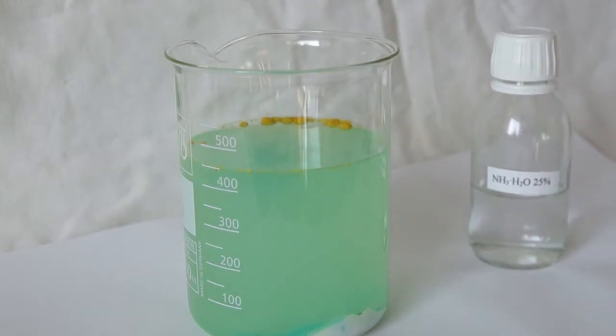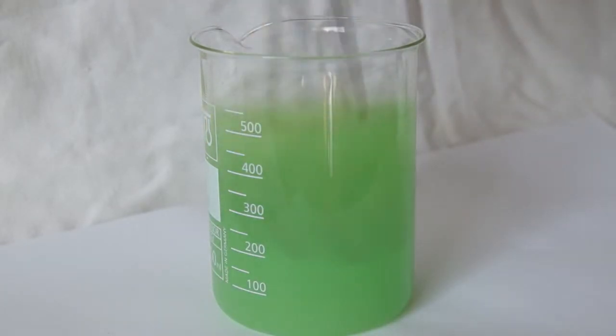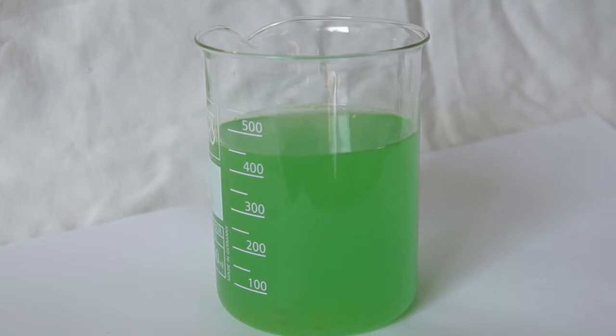Luminol dissolves much better in an alkaline solution. After that, mix it up so that everything dissolves well. And here we have prepared our first solution.